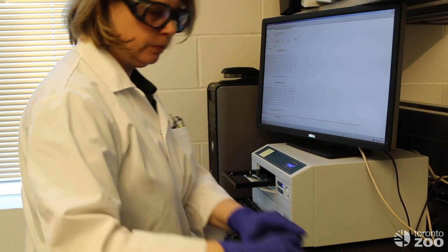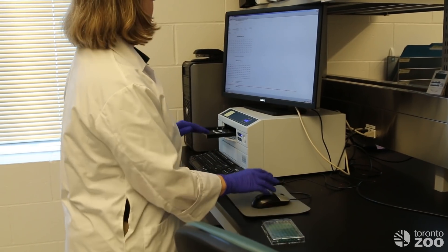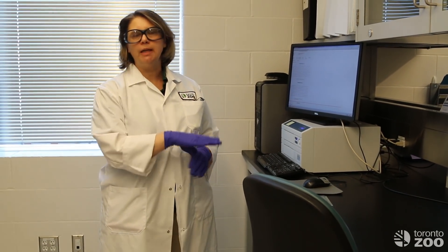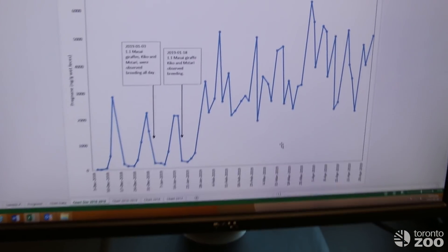This machine has read the colour development of all of the samples, and from that we can tell if Mystari's hormone levels have stayed low or if they've gone up high. In this case, Mystari's progesterone levels went high and we knew she was pregnant.